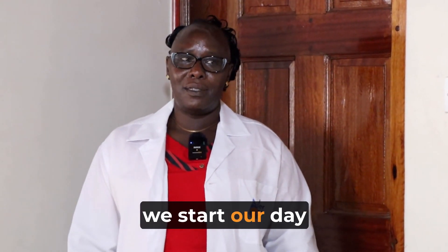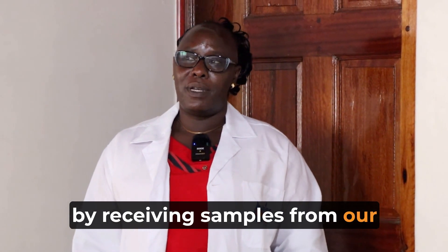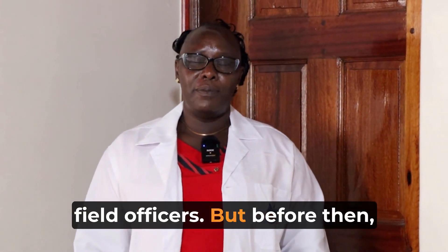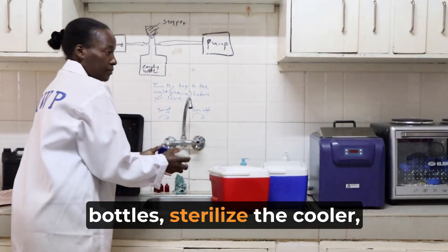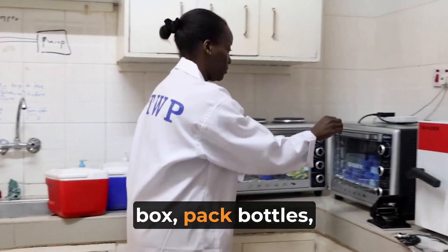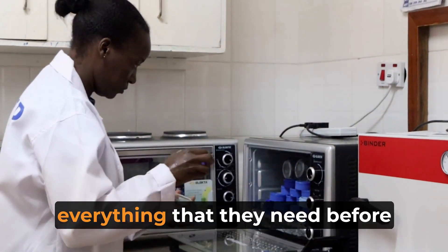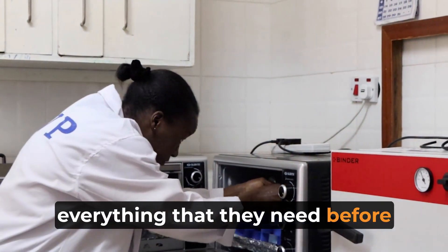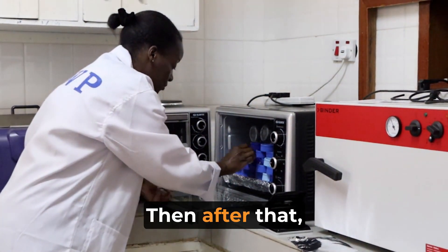We start our day by receiving samples from our field officers. But before then, we have to sterilize the bottles, sterilize the cooler box, pack bottles, pack the wall packs and everything that they need before they leave for water sampling.